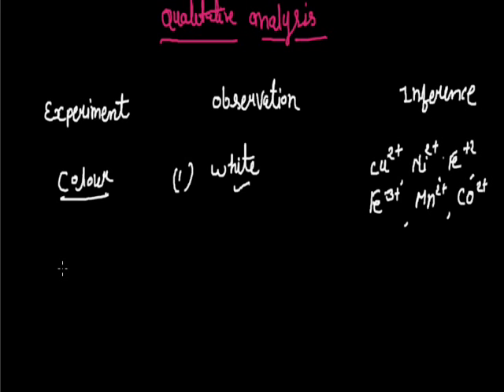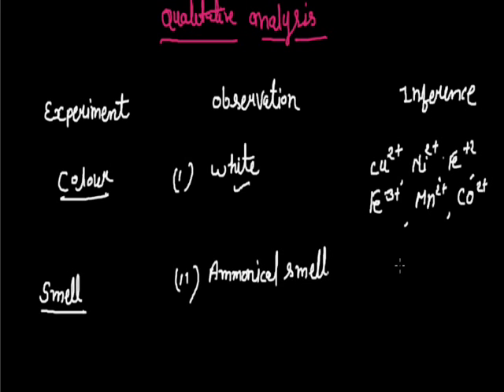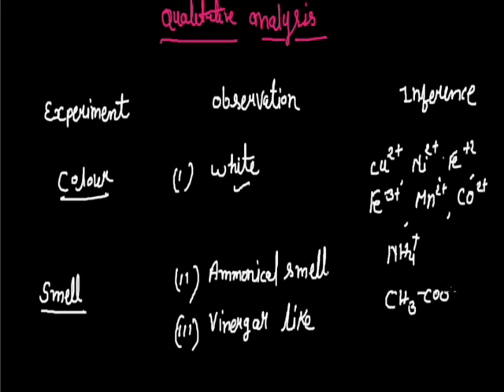Now we are discussing smell. If the salt has an ammoniacal smell, meaning just ammonia-like, then it shows the presence of NH4+, that is called ammonium. Now if the salt has a vinegar-like smell, meaning the smell which generally comes in pickles, it shows the presence of the acetate ion, CH3COO-.